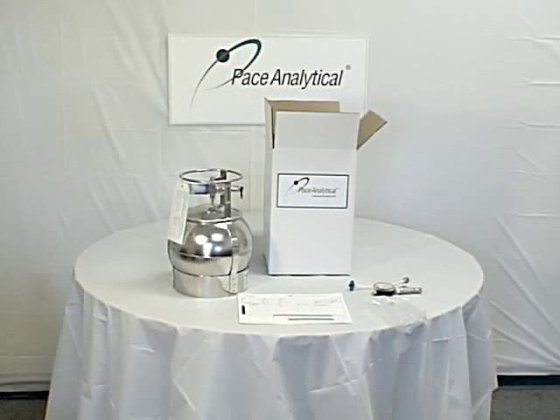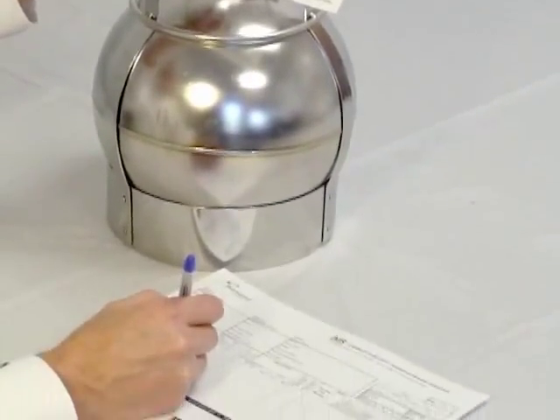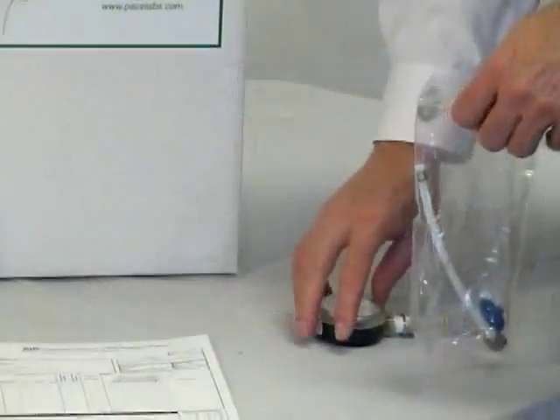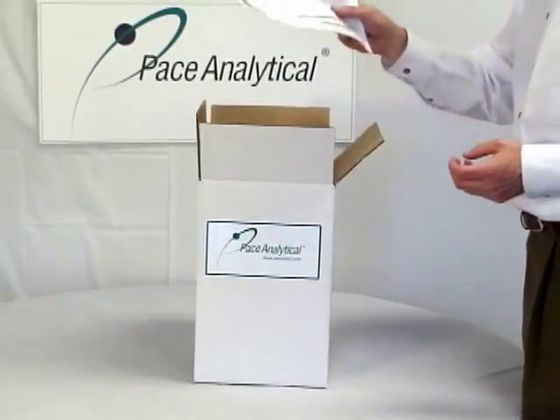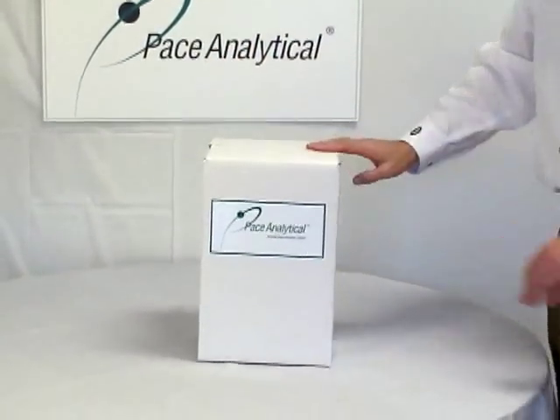Verify that all parts you received are ready to be sent back to the lab. Next, you will need to fill out your chain of custody. Transfer the information from the canister tag when filling out your chain of custody. Be sure to reference the canister ID shown on the chain of custody. Now place everything back into the box, check to make sure the canister and paperwork are included, and if you received a bag of extra media or a vacuum gauge, confirm that these items are also in the box. Then secure the box for return shipment.